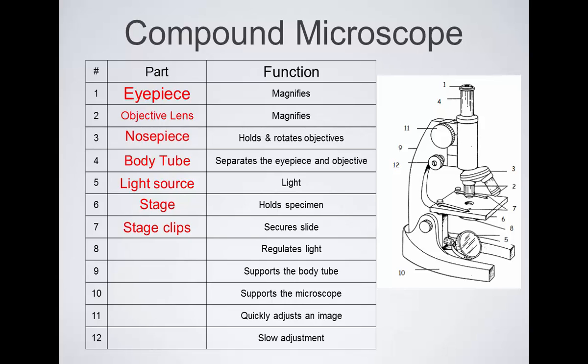Underneath the stage, there's this dial. Paige, what's on the bottom of that dial? Different sized holes. So as I select different sized holes, what do you think that changes? This is on the bottom of the stage, and the holes are different sizes. Matt? How the light reflects? Yeah, a small hole allows less light through, which makes the image dimmer, versus if you select the larger opening, it allows more light through and the image is brighter.